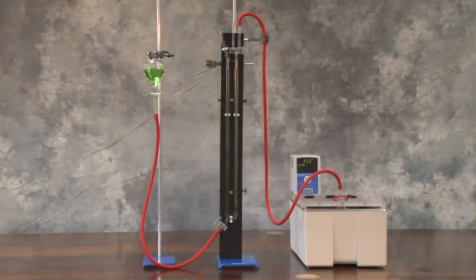Okay, so here is our experimental setup. Over here on the right, we have our reaction chamber, which is currently inside this water bath. The water bath is set at 35 degrees centigrade. As the reaction proceeds, the gas is going to be evolved through this tube, up through this stopcock here, which can be turned so that the gas comes down into this gas burette.